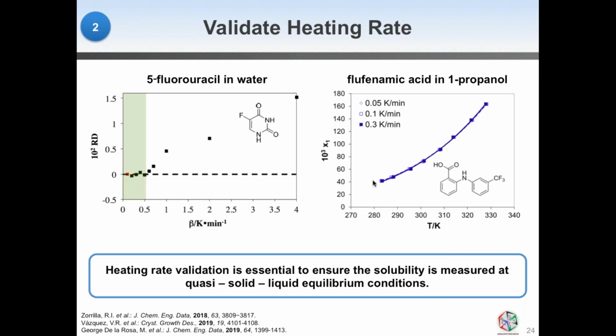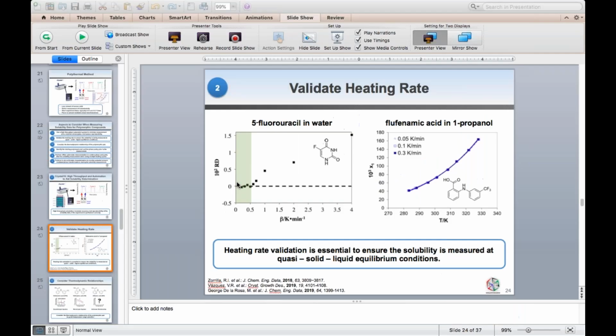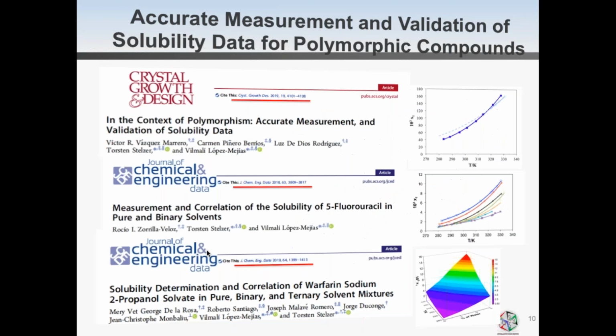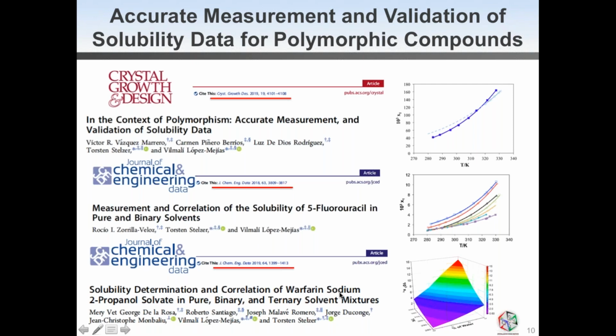No. To answer this question in this way, it was asked: do we have experience measuring a salt form of a molecule? Yes. I mean, this works in a similar way, right? I don't know if this answers the question. As a reference, you can use our paper on this solubility determination for warfarin sodium, which is a salt crystal. And it's actually a solvated salt crystal. So that might give you some aspects of the things to consider.